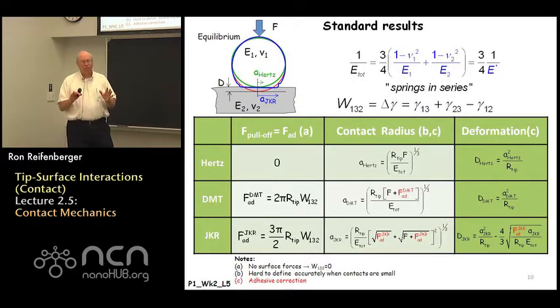I'd like to just collect the important results from the Hertz, the DMT, and the JKR models in this slide. We're not going to derive these quantities.